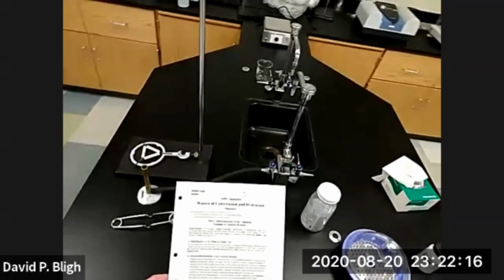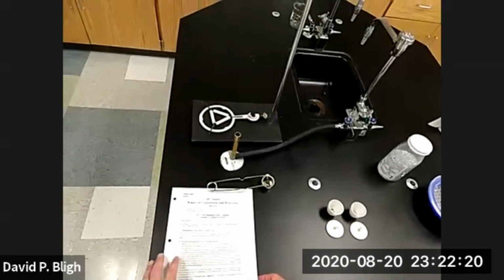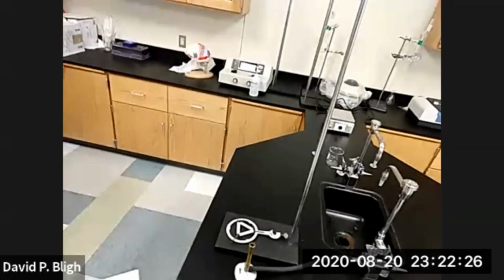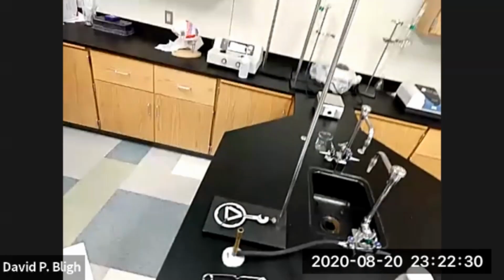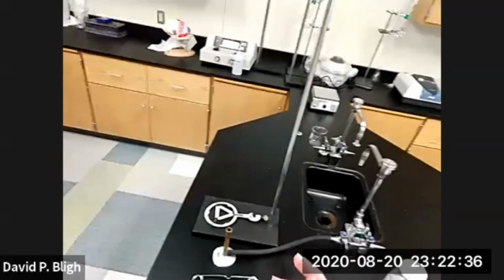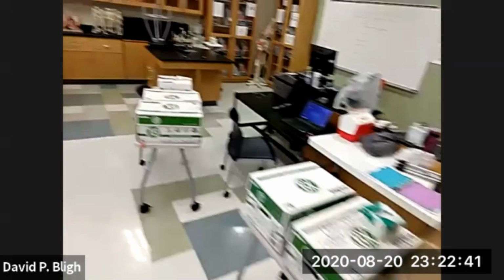Waters of constitution and hydration. All right. The real purpose of this lab is to determine where the water comes from in a molecule, in a formula, and how to calculate how much of the water is attributed to a particular formula. Right? And water can occur in 2 different ways, 2 different places.